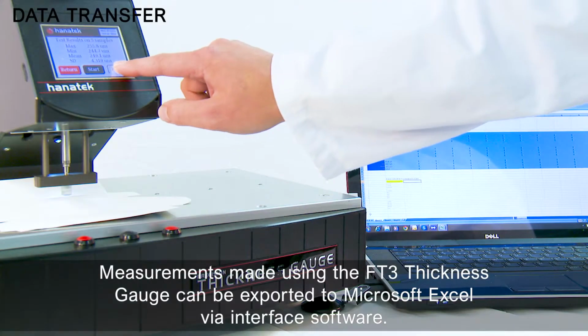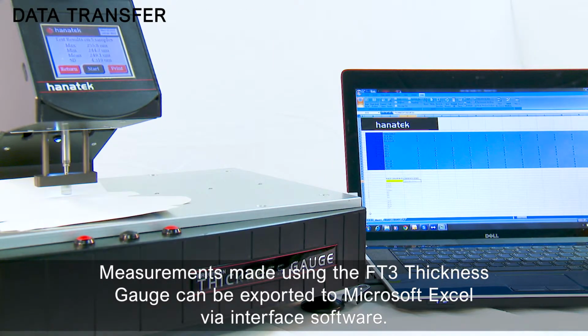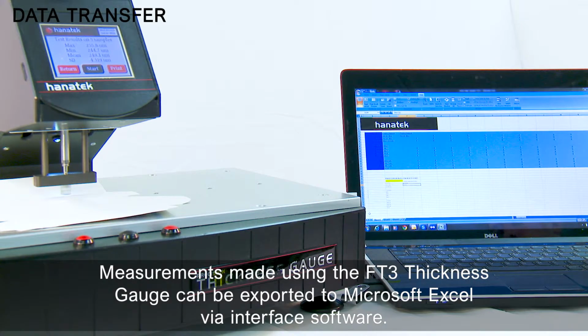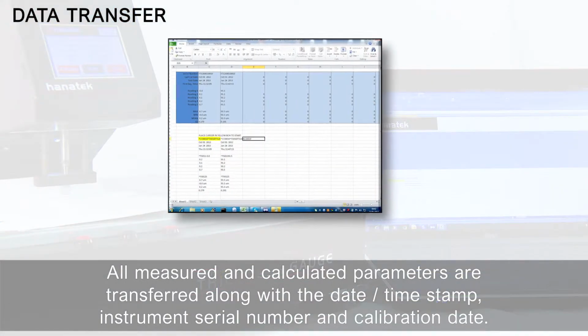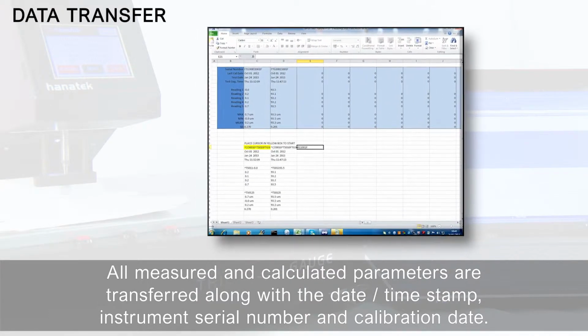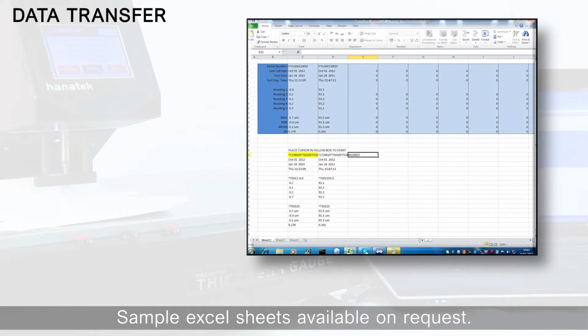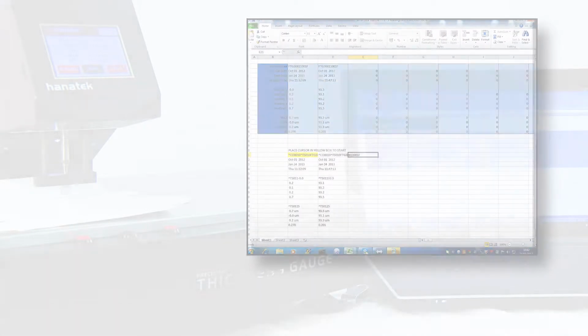Data transfer. Measurements made using the FT3 thickness gauge can be exported to Microsoft Excel via interface software. All measured and calculated parameters are transferred along with the date and timestamp, instrument serial number, and calibration date. Sample Excel sheets available on request.